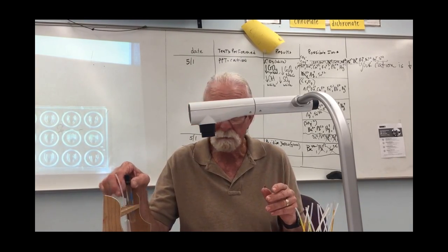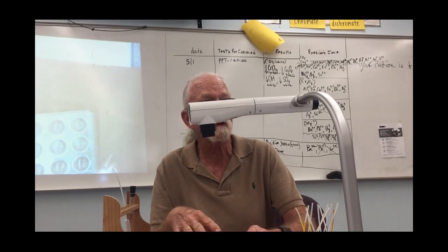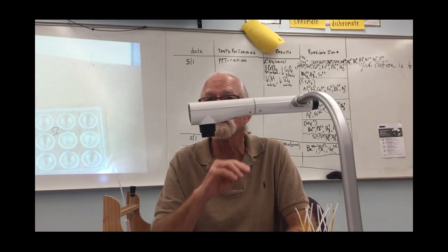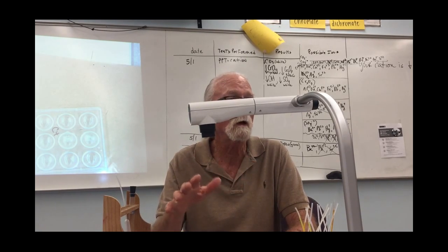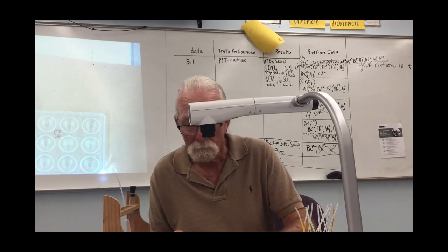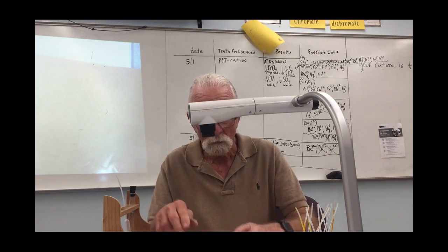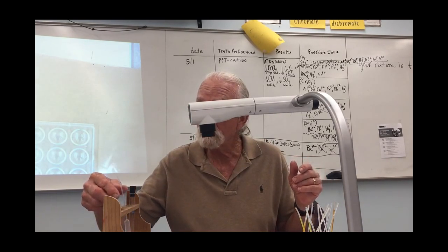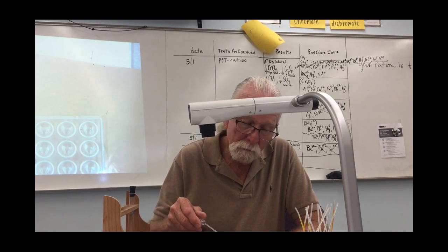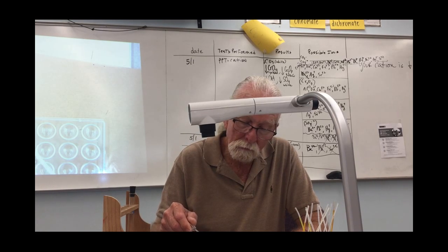I'll start off by making sure that this has been cleaned. That first table will be set up as a wash station. So you take all your stuff, clean it, soap it, dry it, distilled water it, dry it again, whatever. Just make sure it's clean. All right? So I'm going to make sure this is clean. I've got it set up like so. I'm going to take my unknown, get some of my unknown out, and I'm going to put 1 drop in each of the wells. That was 2.